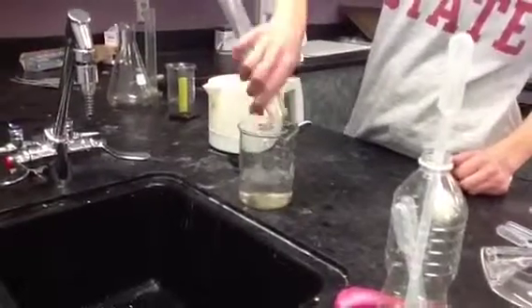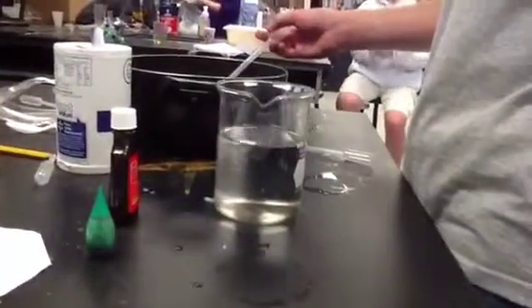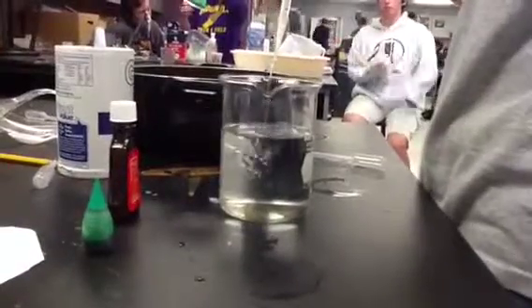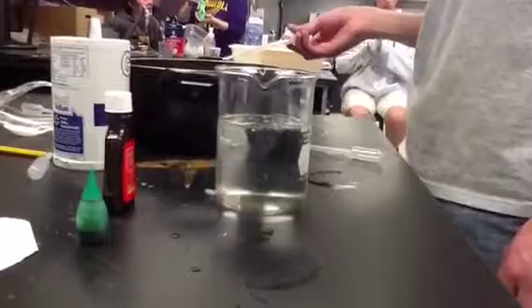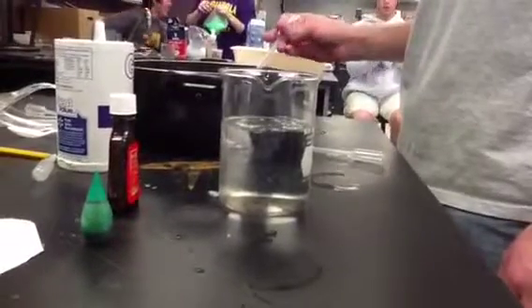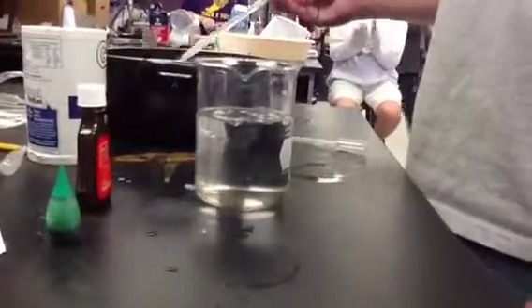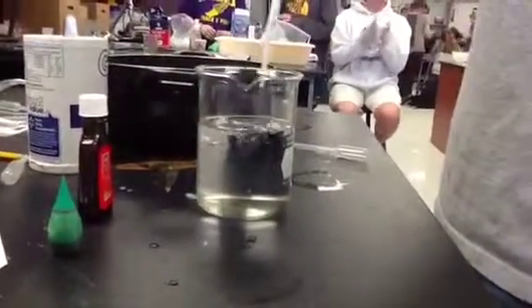I continue by obtaining some vegetable oil and pouring on top of the water in the beaker. There is no required amount for this. You will notice the vegetable oil sitting on top of the water. This is due to the lower density of the oil. Any substance with a density less than 1 gram per cubic centimeter will float on water. Water has a density of 1 gram per cubic centimeter. This goes for any other substance as well. This is the case with the vegetable oil, as shown.